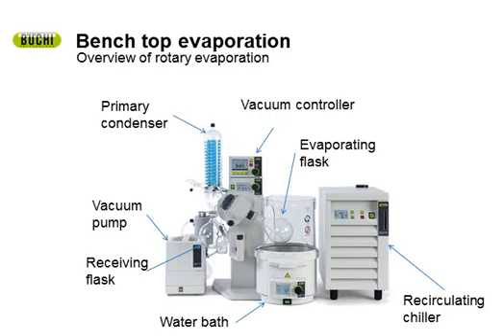If you have a chance to use an all-in-one rotary evaporator, do it. Again, you're going to see a more efficient distillation process. When you can control all the components with one controller, you're going to save energy, it's safer, and it's easier to perform these evaporations. So if you can, please do so.